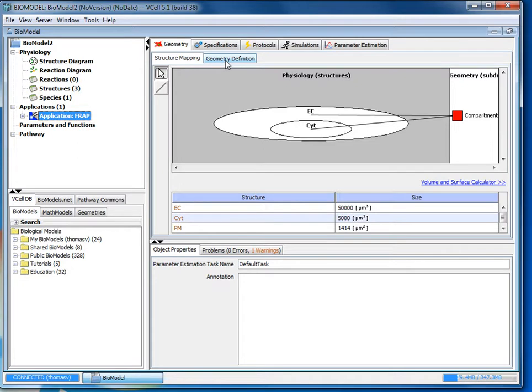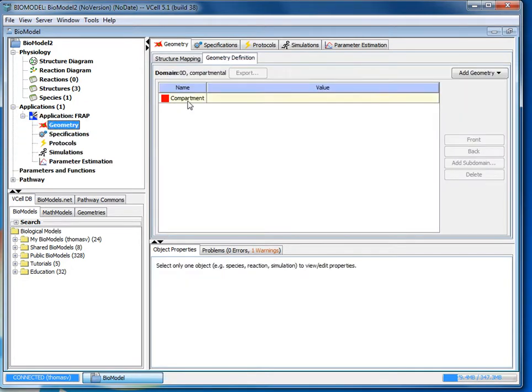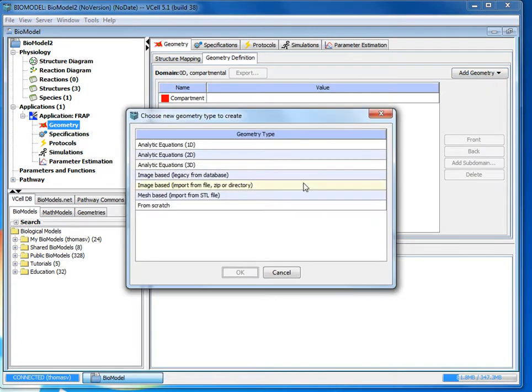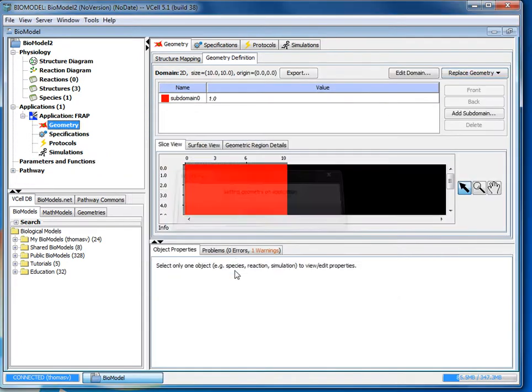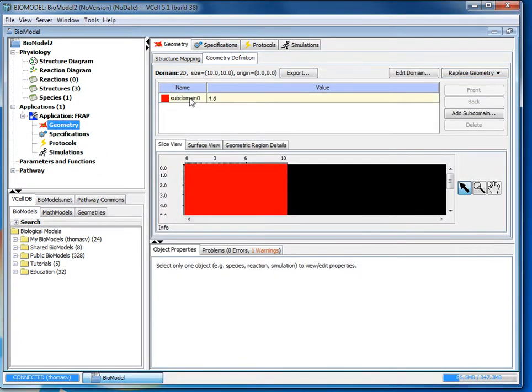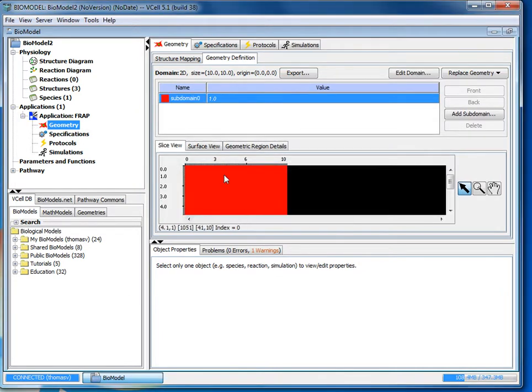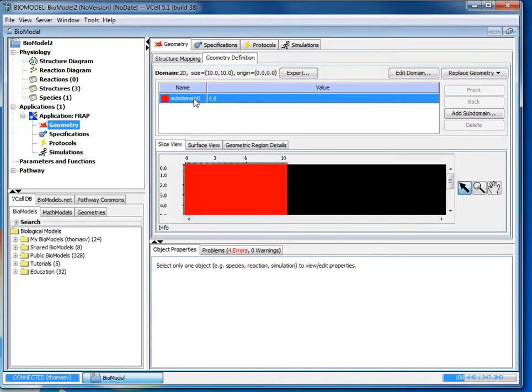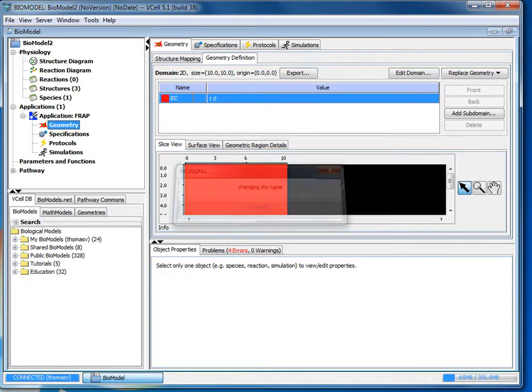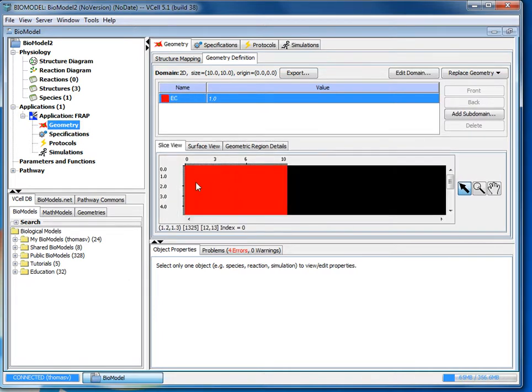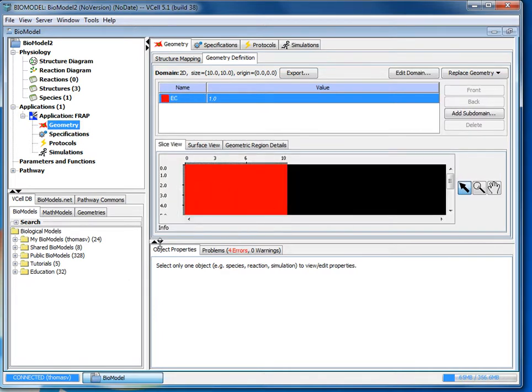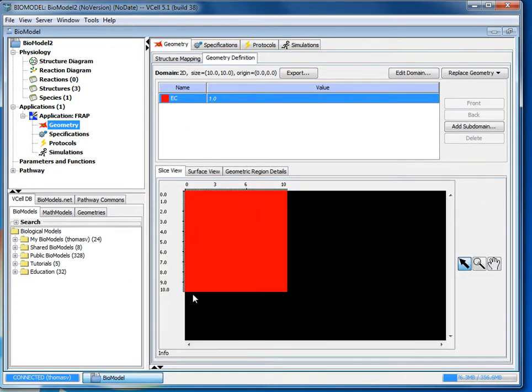Click where it says geometry definition and then select add geometry, new, analytic equations, two dimensional. And then subdomain zero will pop up and we'll change the name to EC. So this region will represent the extracellular region. And if you can't see it, you can use these arrows to change how you partition your screen. Or you can just make the window bigger.